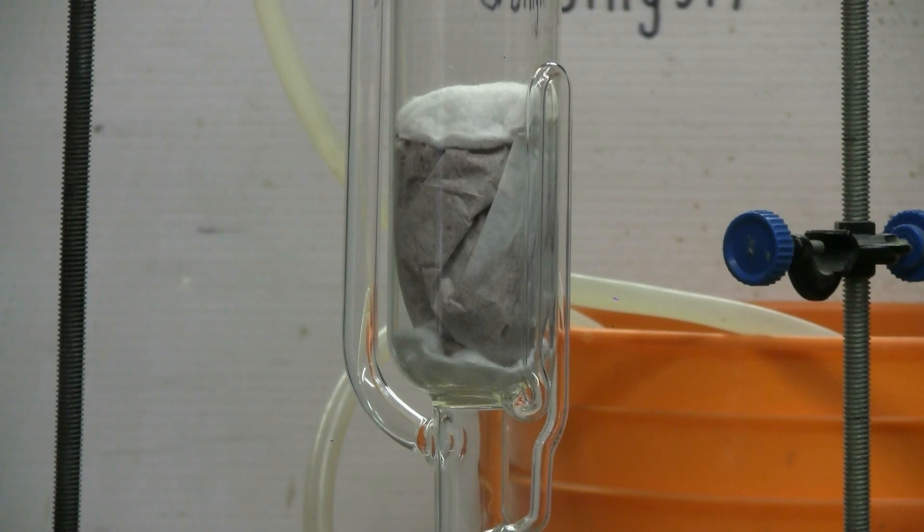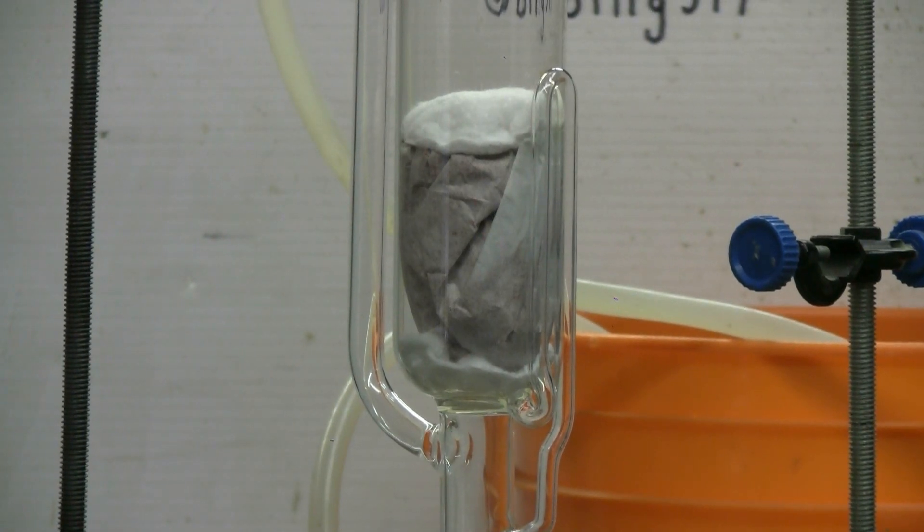I've taken some of the hot chili powder from the packet I showed earlier. It's now in a coffee filter in the Soxhlet chamber with a cotton swab above it and another one below it for filtering. The condenser water flow is turned on and so is the heating mantle. I'm using ethanol as my solvent for this one.